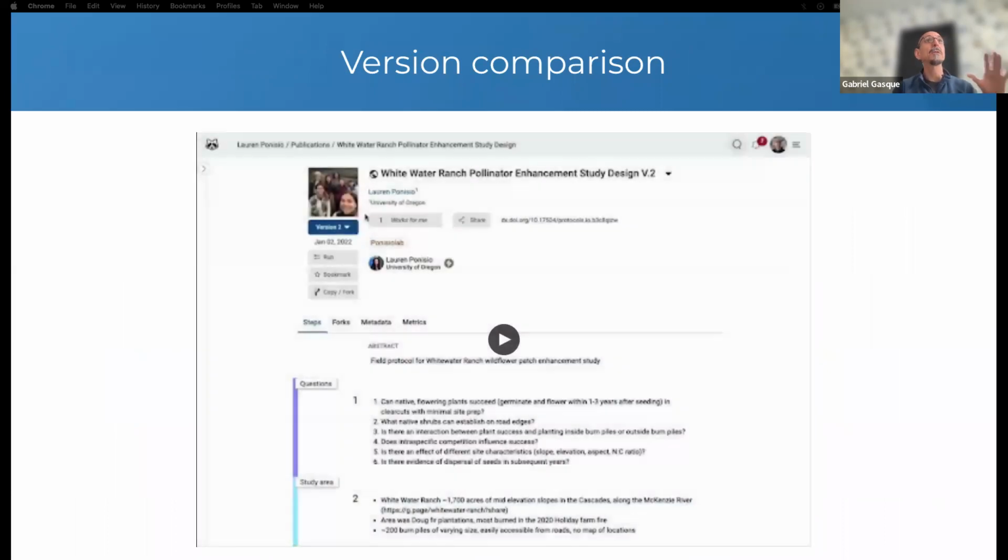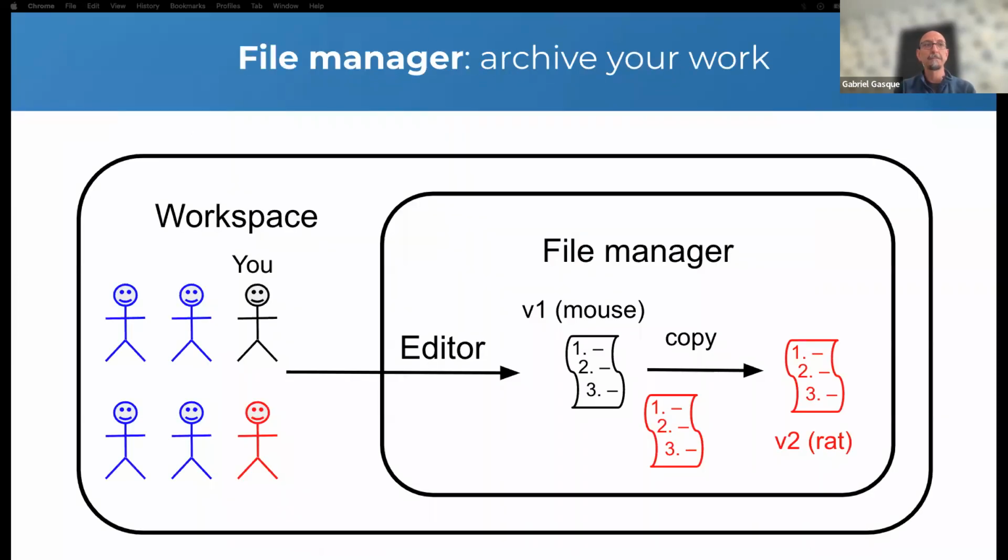So you have a detailed record of all improvements to the protocol, and you can follow up the history. And even if a member of the workspace leaves because, for example, a graduate student graduates, the protocols remain organized, up to date, and available in the file manager.